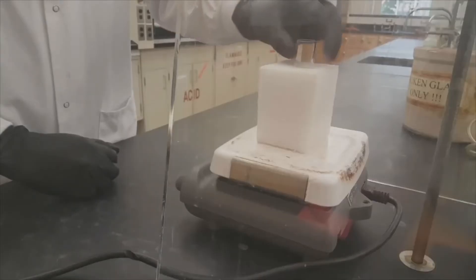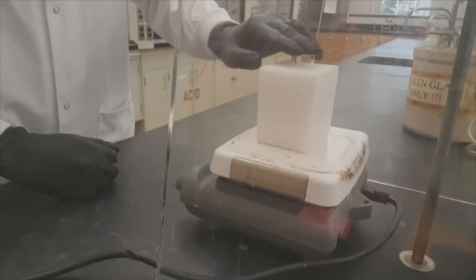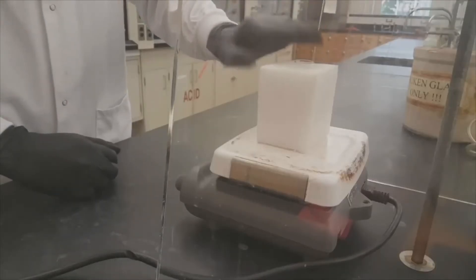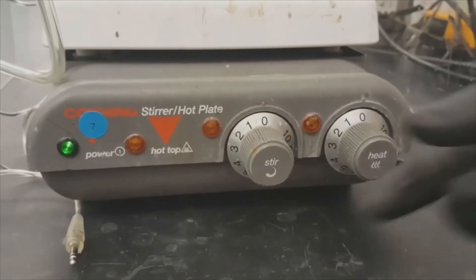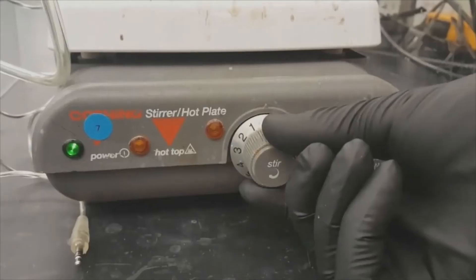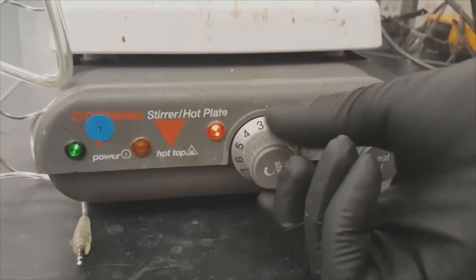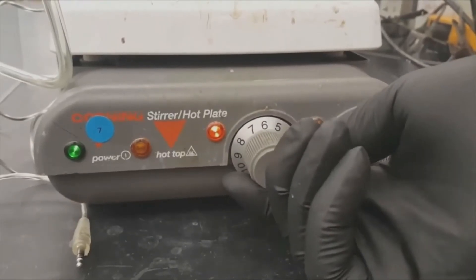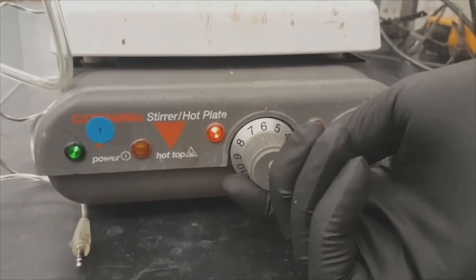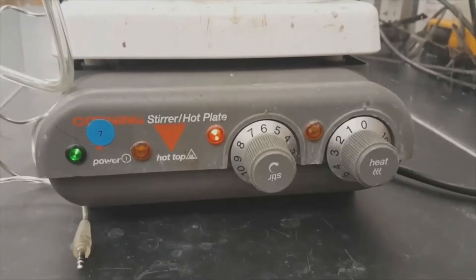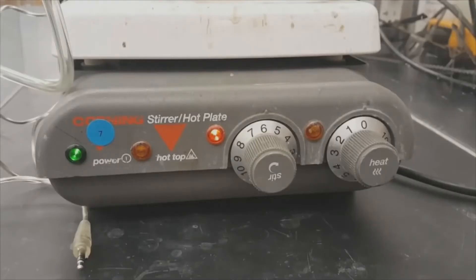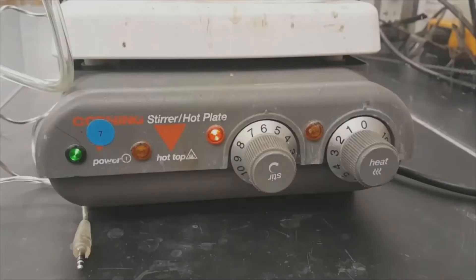Then you're going to put this whole thing on top of the stir plate. Be careful because your stir plates frequently also have a heat setting. You want to make sure that you're using the stir setting, not the heat setting. If you use the heat setting, it will melt your styrofoam block and it will smell bad and everyone will be very unhappy.